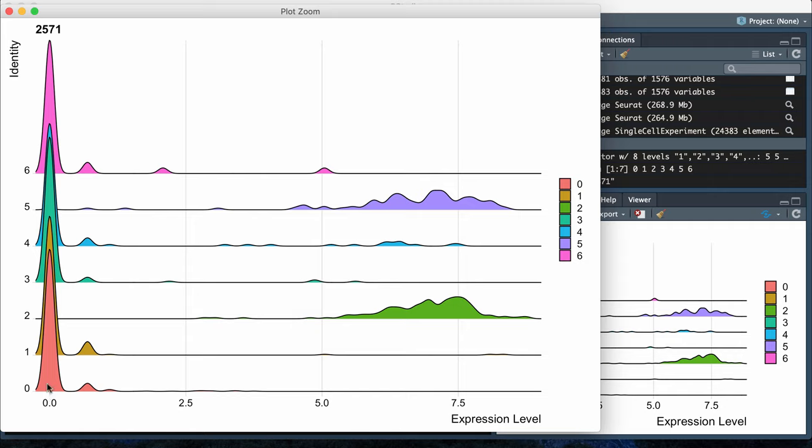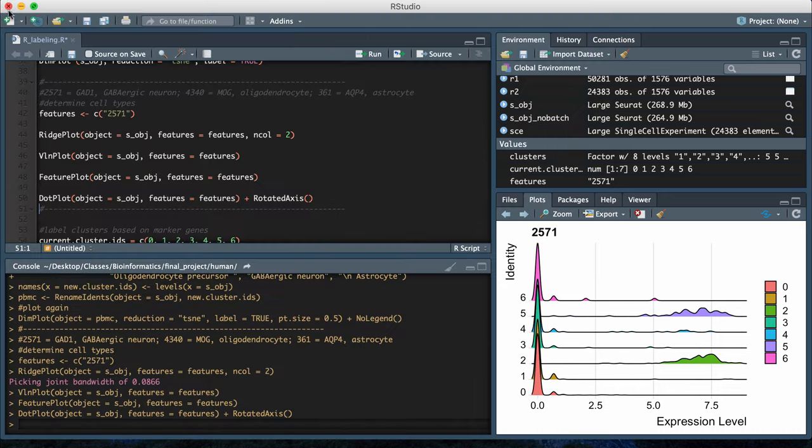This is zero, so a lot of the clusters are showing high zero expression, and then you're seeing high level expression for two clusters, cluster five and cluster two. It's possible that cluster five and cluster two are the cell type of GABAergic neuron.